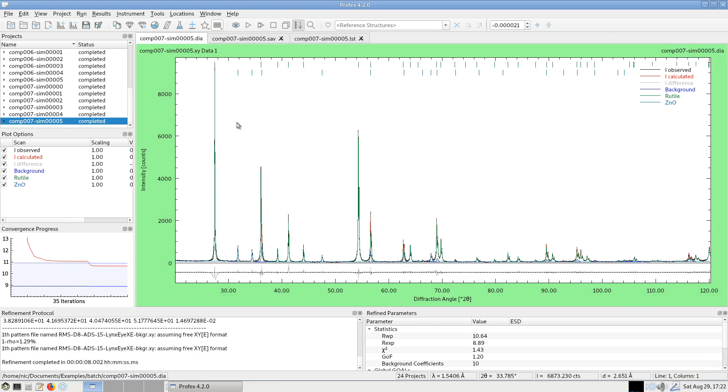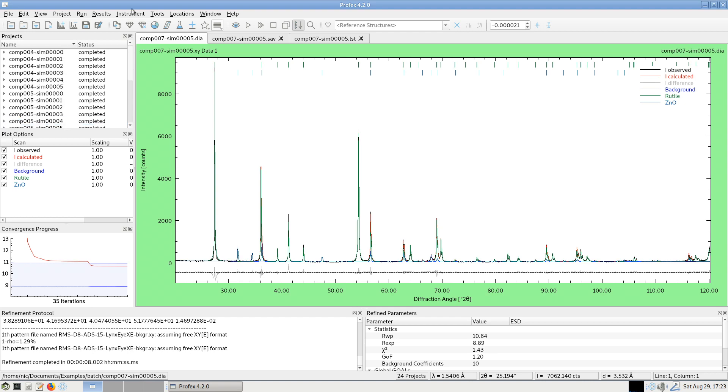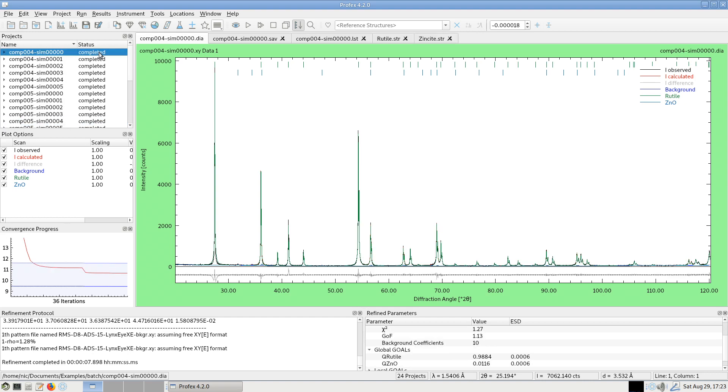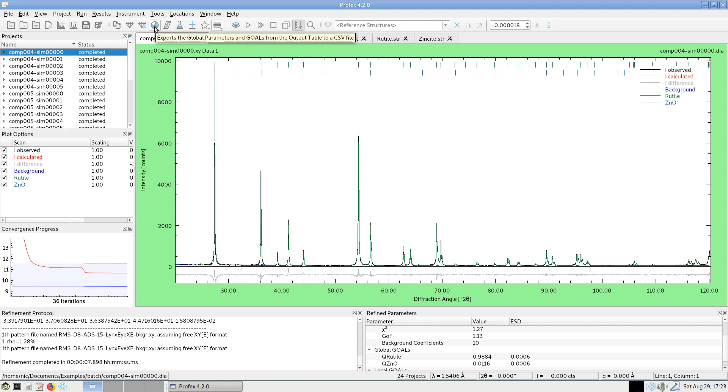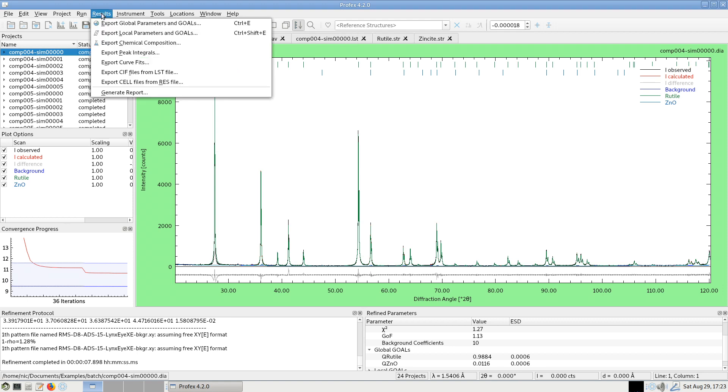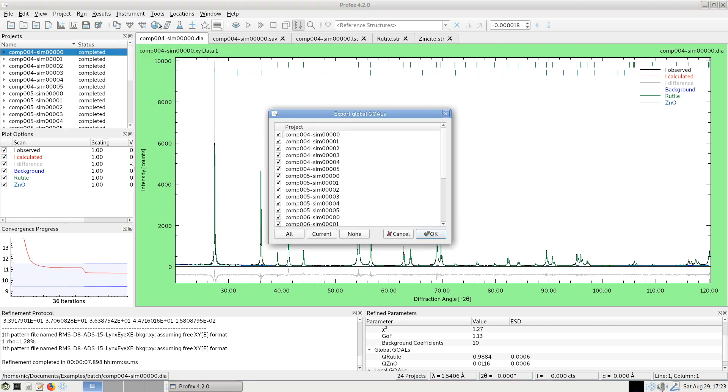And when it's all done, my 24 files have been refined with the same optimized refinement strategy I set up for the first file. And now I can, for example, export the results, the quantities, which are part of the global goals, either by clicking this pie chart button or by going to the results menu, export global parameters and goals.